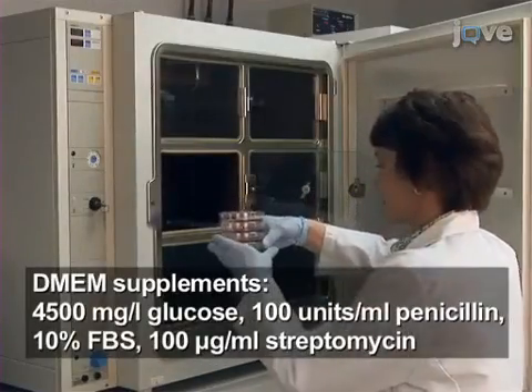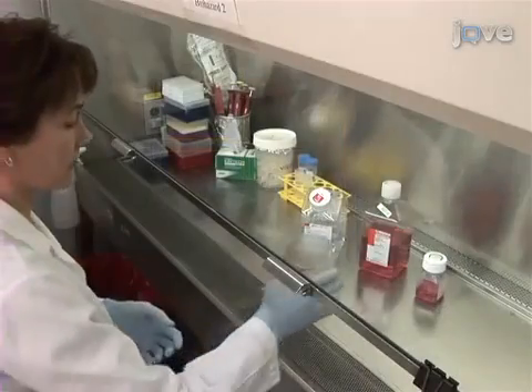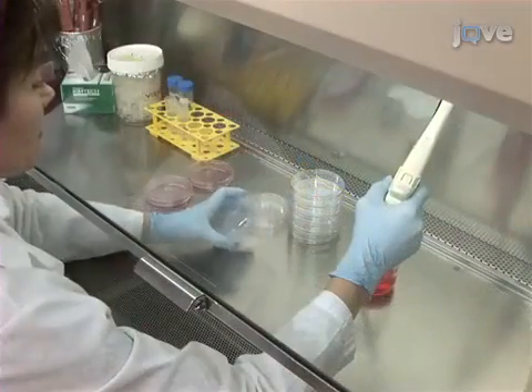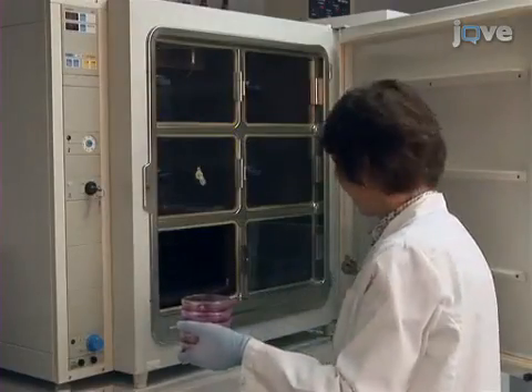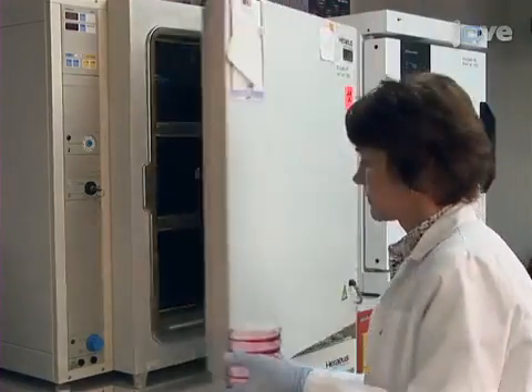Lentiviral vectors are produced by co-transfection of plasmids into 293 T-cells. The 293 T-cell line should be maintained in modified DMEM. For this experiment, seed 10 100-millimeter culture dishes with 293 T-cells at 30-40% confluence. After 20-24 hours of culture, the cells should be at about 80% confluence and therefore ready for transfection.